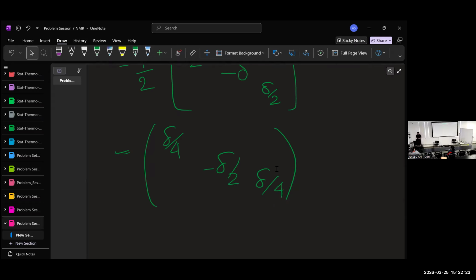Yeah, so maybe you're going to study an octahedral complex or something? Has that been done? Probably. Like Christian Fourier or something like that? Pretty cute. Yeah, I guess that's what we would have to do: find a two-site hop through 90 degrees. And this is what you would land with.